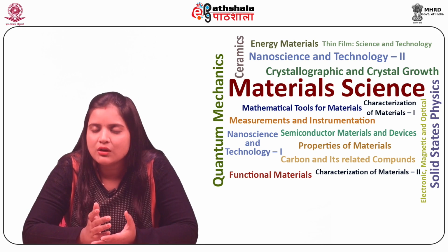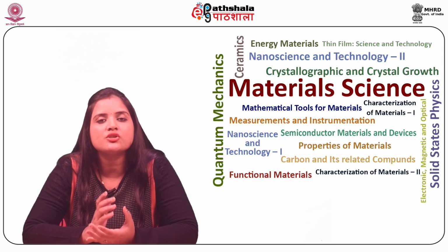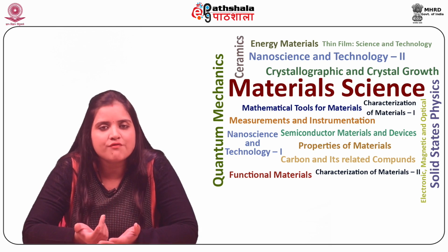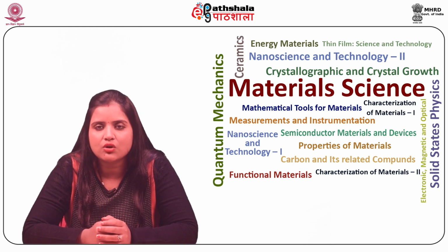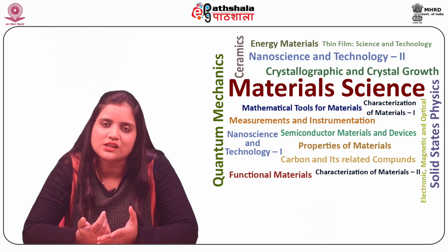Industrial inspection is one of the most useful applications of DHM. Typical applications include implant roughness, structure of semiconductor components, solar industry, industrial metrology, etc.